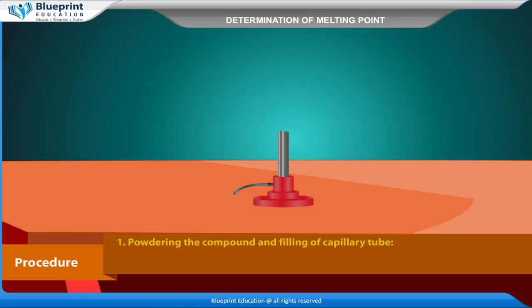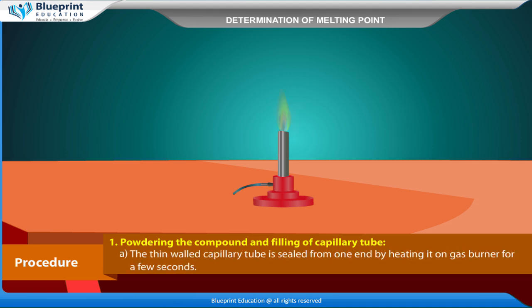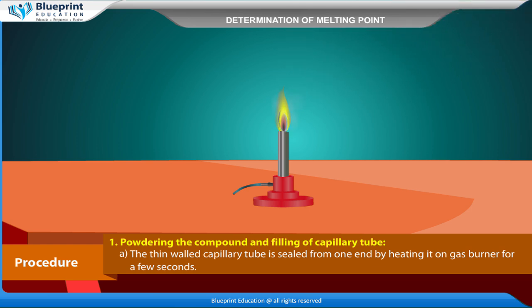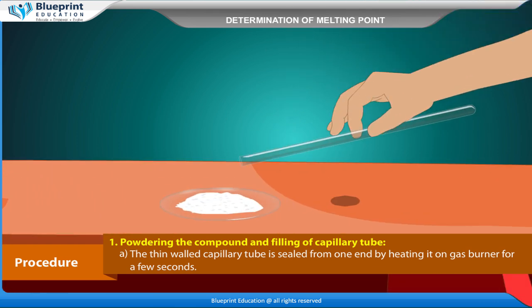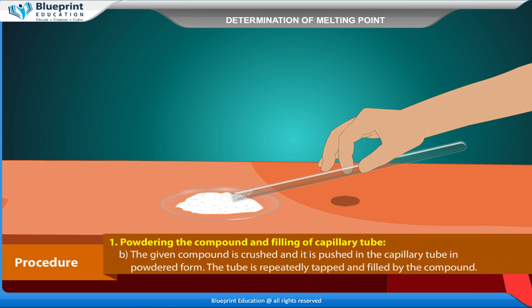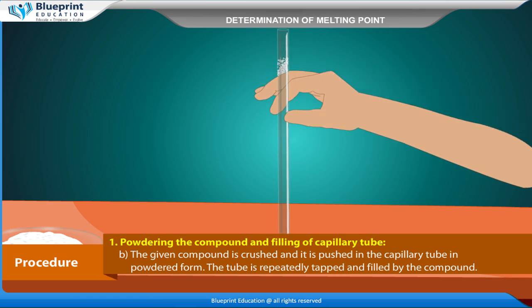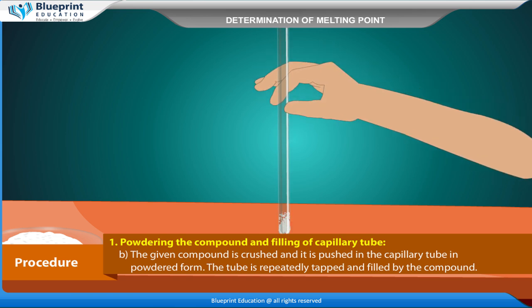Procedure — Powdering the compound and filling of capillary tube. A. The thin-walled capillary tube is sealed from one end by heating it on a gas burner for a few seconds. B. The given compound is crushed and pushed into the capillary tube in powdered form. The tube is repeatedly tapped and filled with the compound.